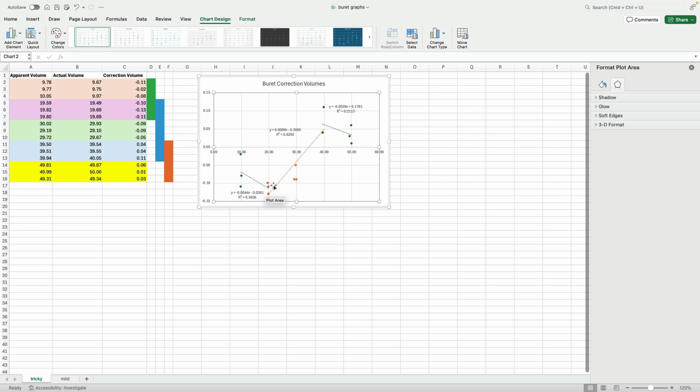I think that this trend line is more or less going in the right direction, and it's starting, passing through, and ending near at least one of the data points in your data set. So that's probably as good as we're going to get. I think breaking it down might be a little better, but I think you could probably just go with this.